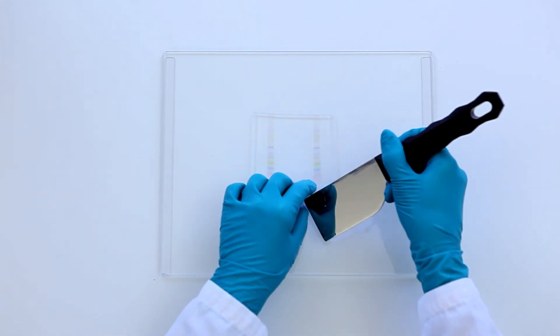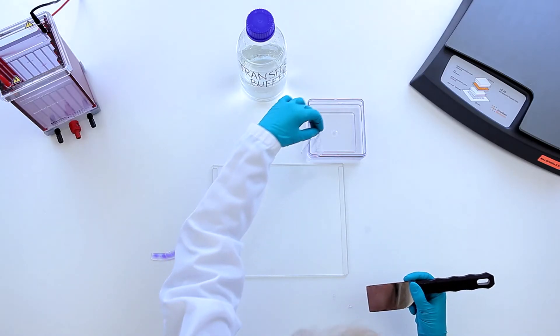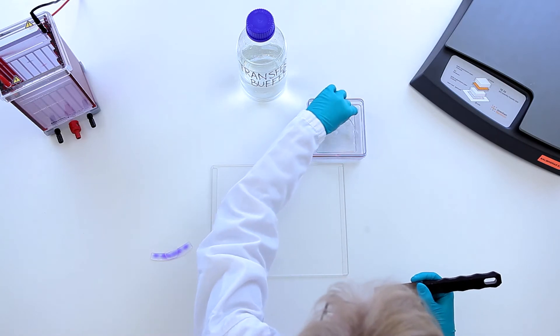Prepare the gel for blotting by trimming excess gel. Equilibrate in transfer buffer for 10 minutes to maintain the shape of the gel. I will now take you quickly through a Western blotting procedure, beginning with building the sandwich and highlighting key issues.